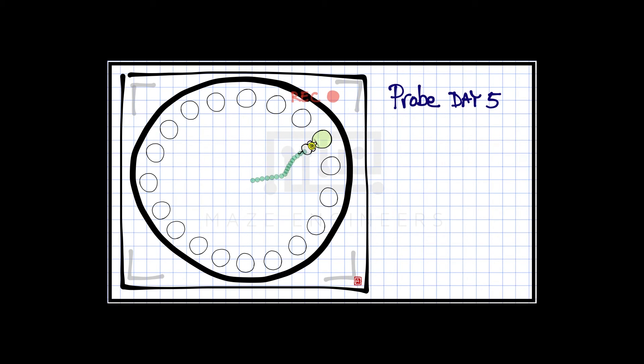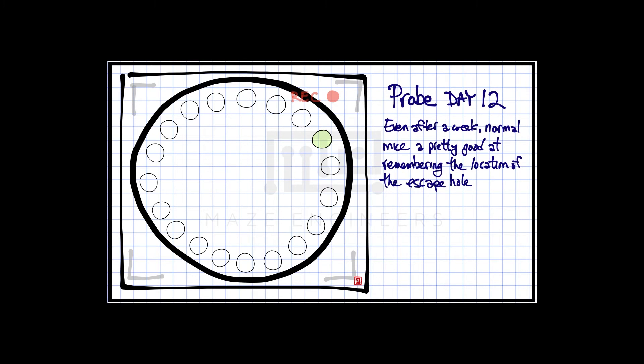Probe Day 5. Probe Day 12. Even after a week, normal mice are pretty good at remembering the location of the escape hole.